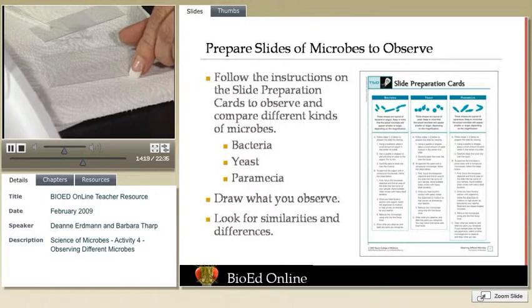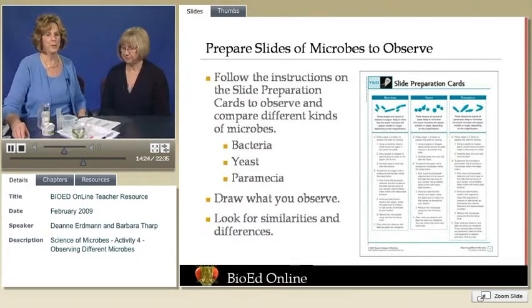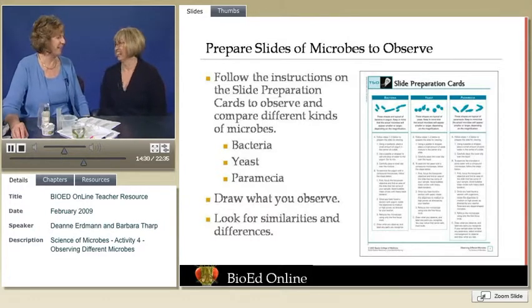It's under there. Little bitty moving around little animals. It's so cool. Little animals. And so again, not really actually animals, but little animalcules. Animalcules. Yeah, I think so. Now we know how they got that name.